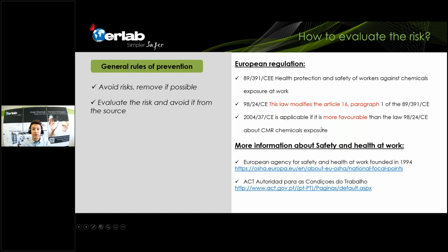Of course, you need to evaluate the risk and avoid it from the source. So it doesn't make sense to go and look for a solution at the end of the chain. No, go and look for the source. And in most of the cases, it's just the chemical product itself that you have to look for.